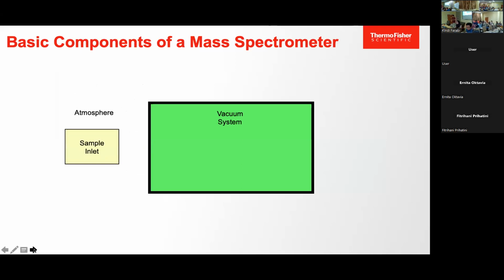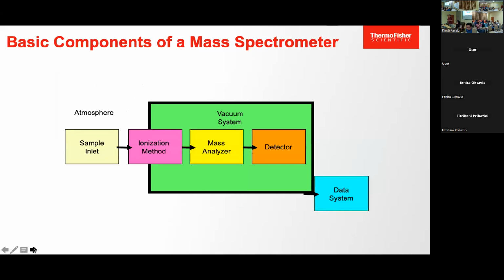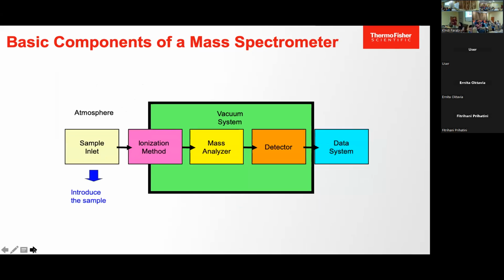Okay, so now we understand the requirement of selectivity and specificity. Now we look into a little more detail about mass spec. I mentioned earlier, you need liquid chromatography to do separation and injection, and the liquid chromatography is in atmospheric conditions, our room environment. But when you reach the ionization source, where you convert the compounds to either positive or negative ions, it will be in vacuum condition.